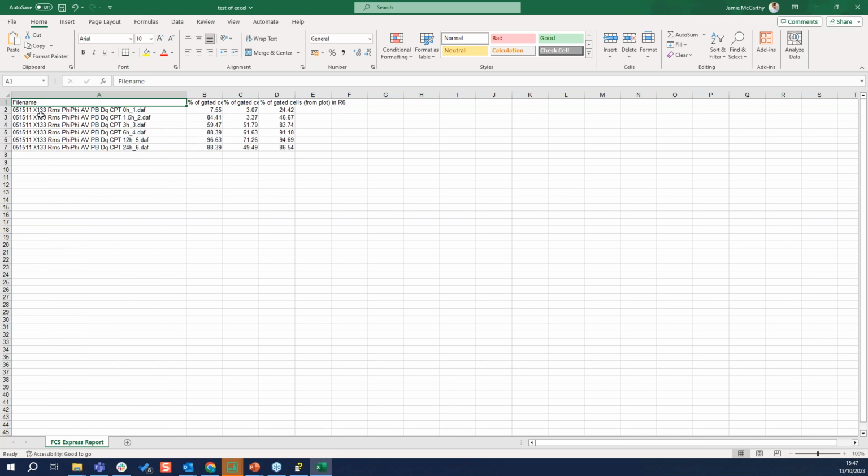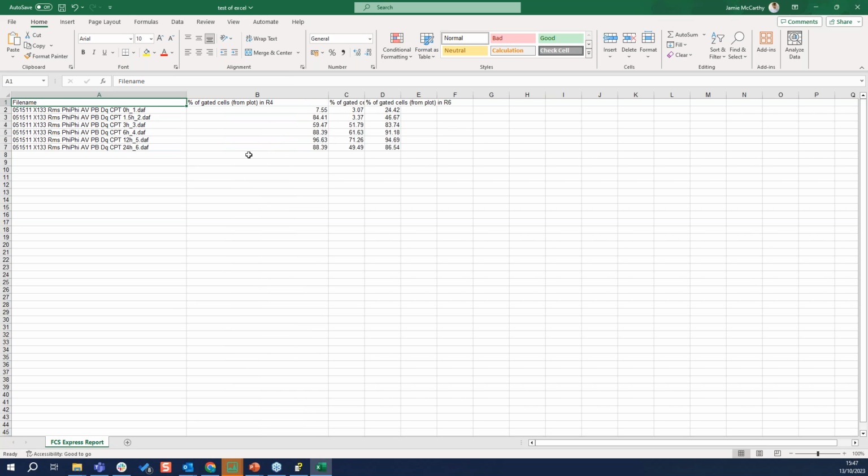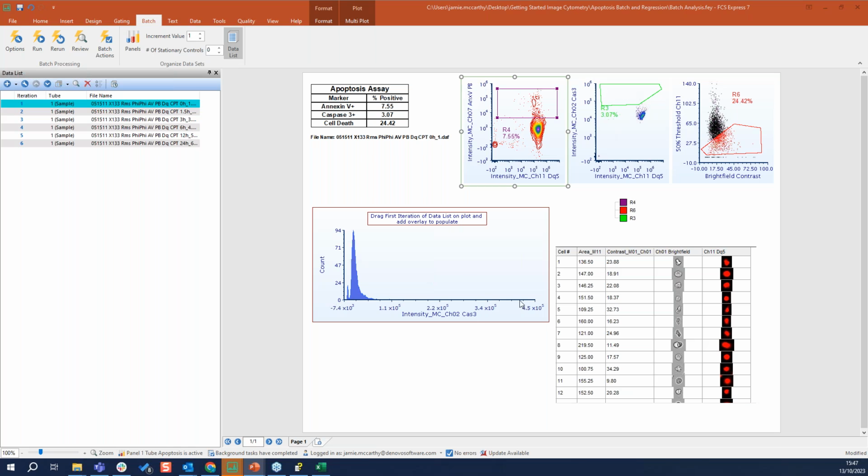And we also have this Excel. Notice we have this first column, file name, super explicit, how things are organized. And then we have these statistics again down here. So these are the type of things that I talked about. Maybe you want to free text this name, or maybe you want to edit in your user options. Up to you to get exactly the statistic that you want.